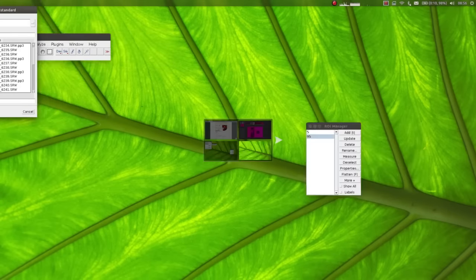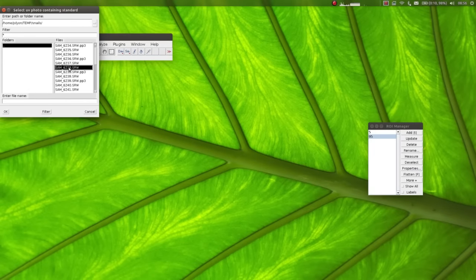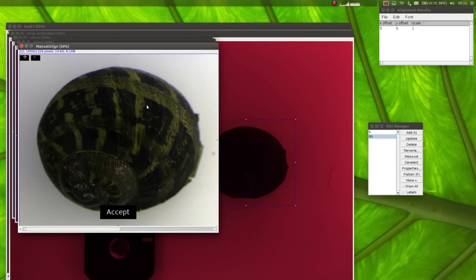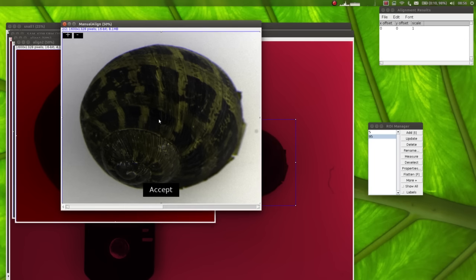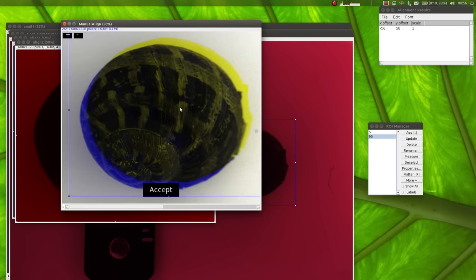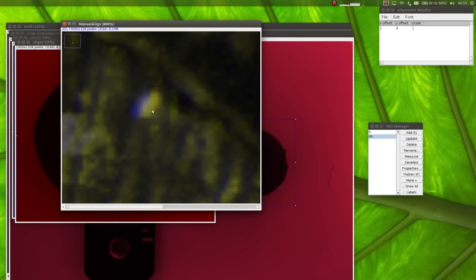Next it's asking me for the UV image, so I'll go and check that was this image. And here is the alignment, the manual alignment tool. You can press plus on your keyboard to zoom in and minus to zoom out. And all you need to do is drag one image over the other to try and get the best alignment possible. So you shouldn't be able to see any of these yellow or blue fringes around anything. So you can do that by finding a nice little landmark like this and dragging it around until it has the best fit.